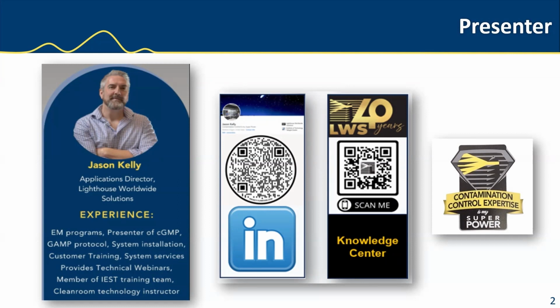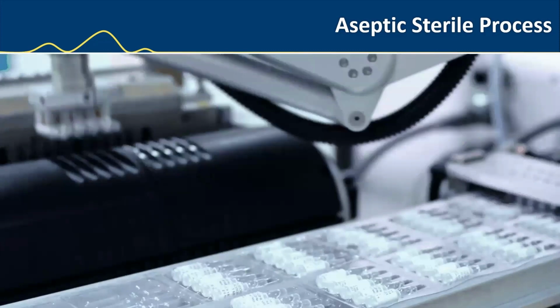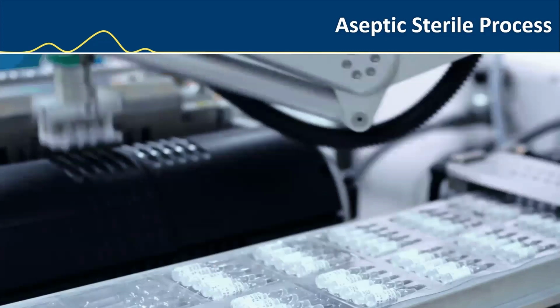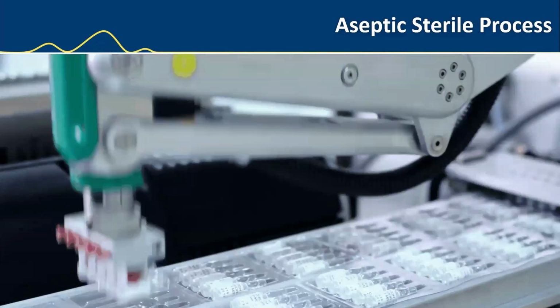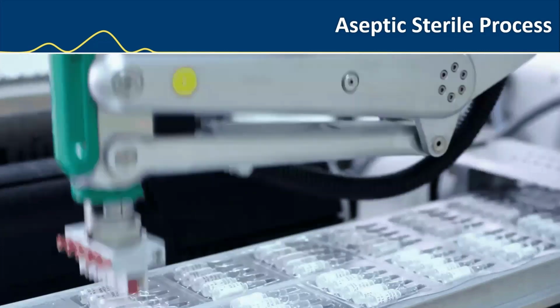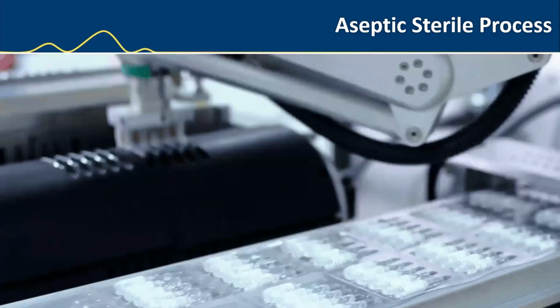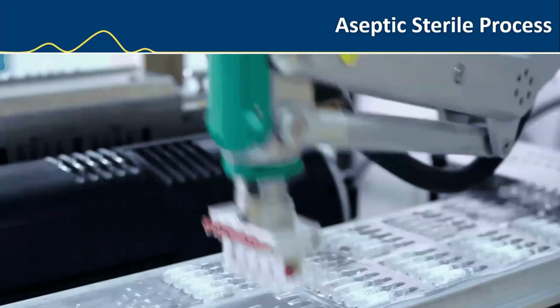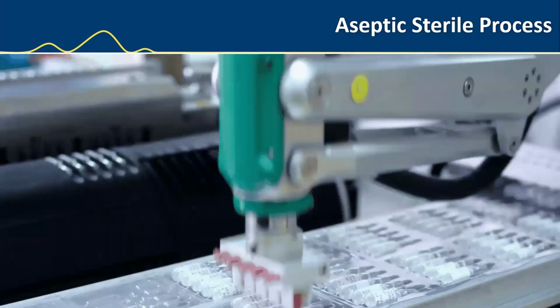So let's talk about our subject today. I wanted to talk a little bit about aseptic processing, the art of performing a specific process within an ultra clean environment to ensure that the product, in this case an injectable, is transported from bulk sterile containers and filled into vials or syringes or capsules. I'm going to take a deep dive into continuous monitoring of the aseptic processes, and we will concentrate on microbial monitoring, especially since EU GMP Annex 1's latest release has pushed us further in that direction, where continuous microbial monitoring is now required.